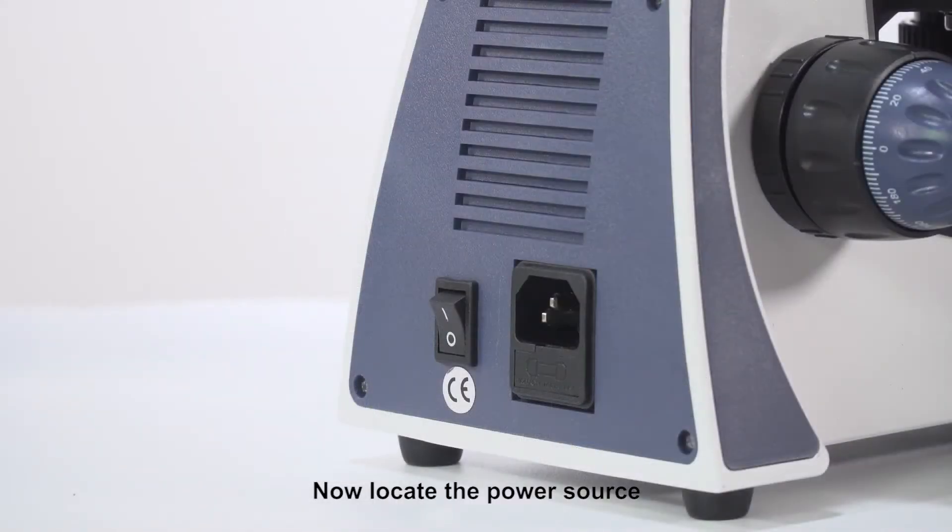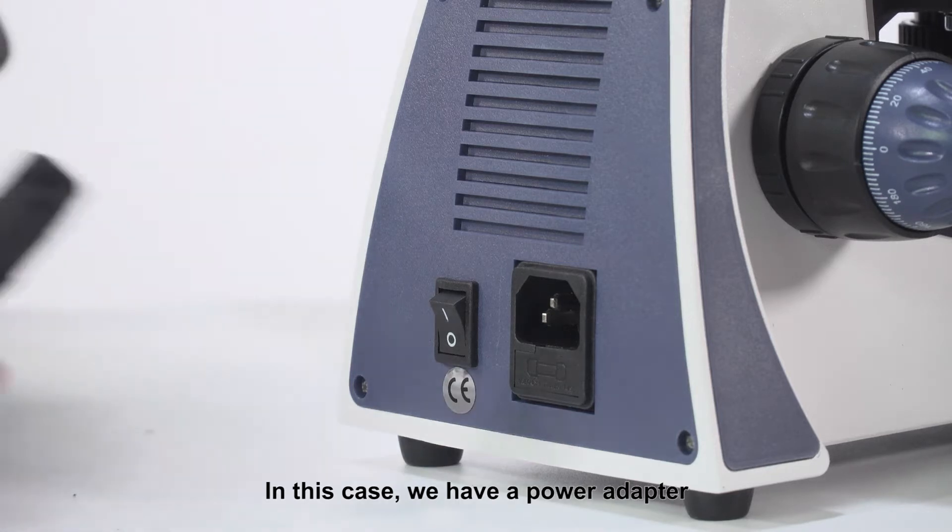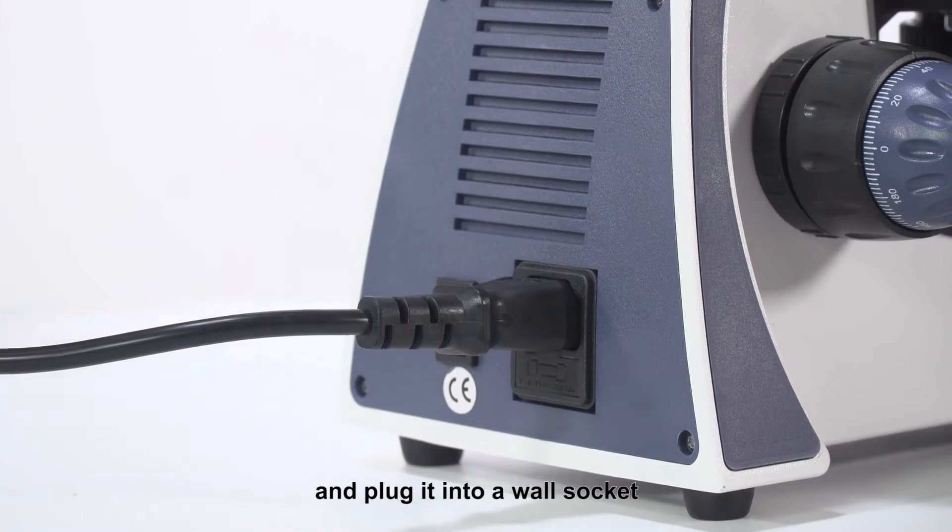Now locate the power source. For some microscopes this may be a battery compartment. In this case we have a power adapter. Connect the power adapter to the microscope base and plug it into a wall socket.